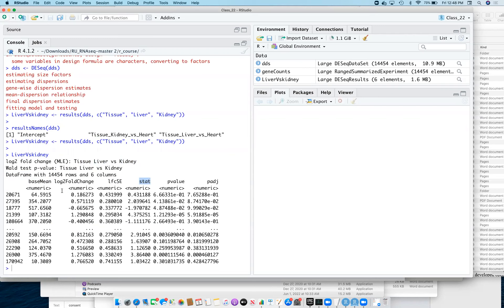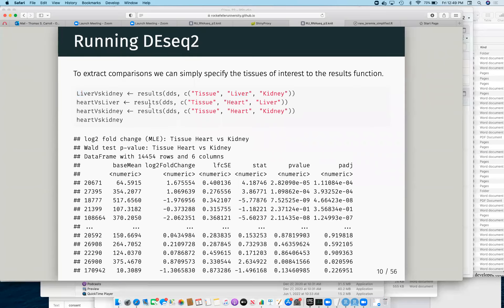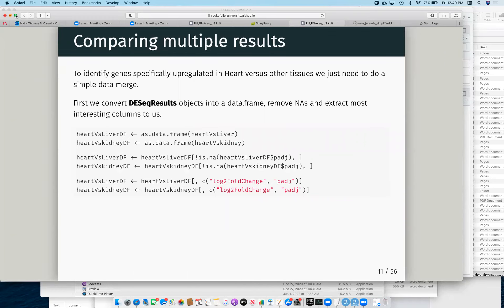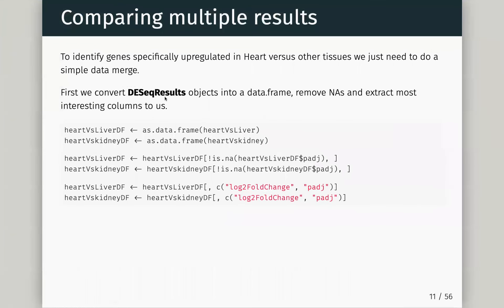This isn't quite a data frame as we understand it — this is a capital-D capital-F DataFrame, a Bioconductor DataFrame, with Entrez gene IDs as row names. We can of course just convert these objects into our standard data frames, which is what I usually do. We can do this just by doing as.data.frame — we can convert a lot of objects using something like this, including as.vector and as.character. In this case it makes sense to convert a Bioconductor DataFrame to a standard data frame just by using as.data.frame. We'll get an object which looks very similar.